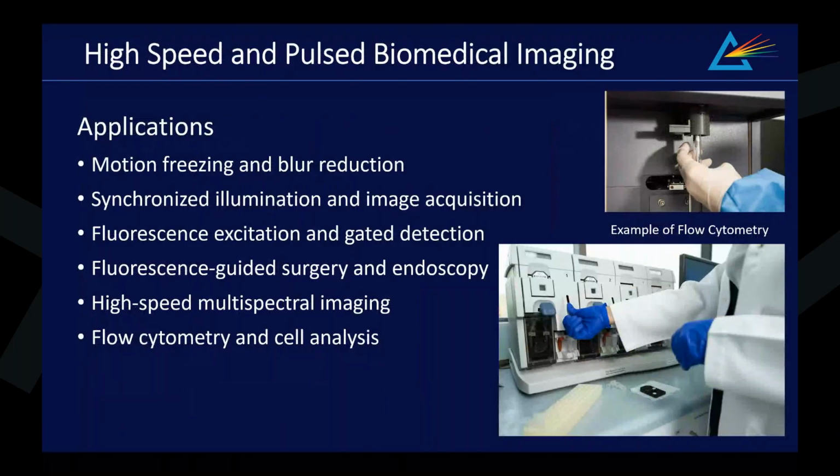High-speed LED illumination is most valuable when illumination must be synchronized with image acquisition, wavelength switching, tissue motion, or time-resolved fluorescence measurements. Examples include fluorescence microscopy, multispectral imaging, endoscopy, fluorescence-guided surgery, flow cytometry, shown in the images here, retinal imaging, and fluorescence lifetime imaging.